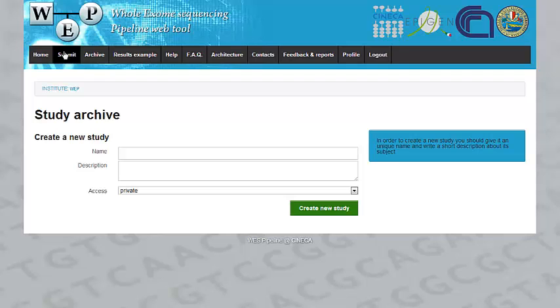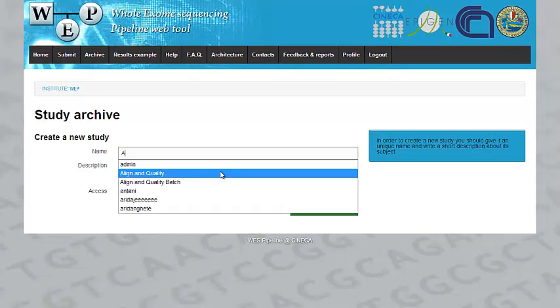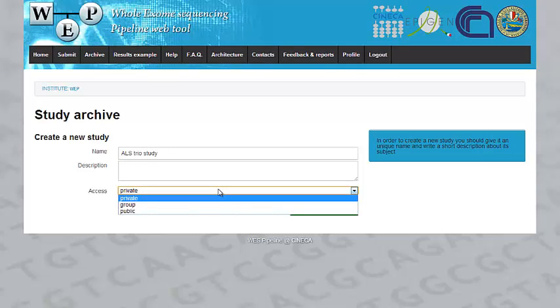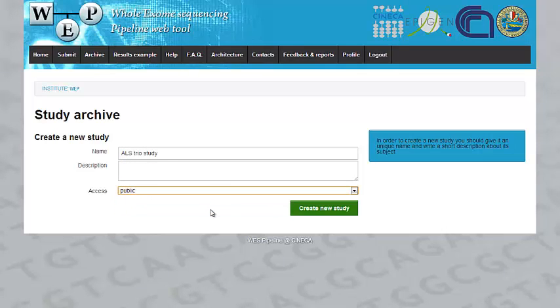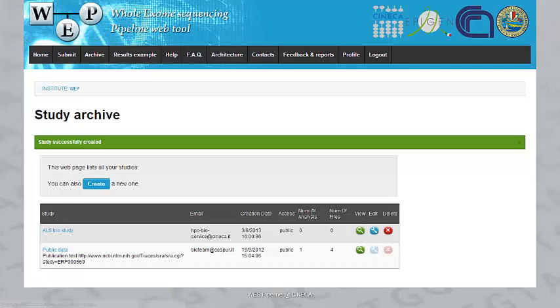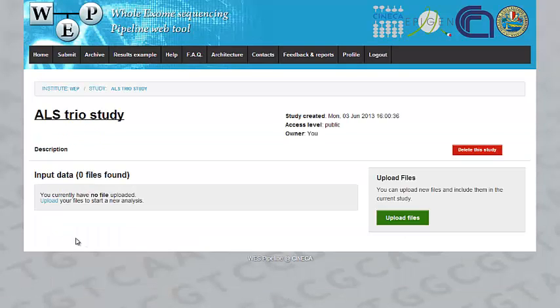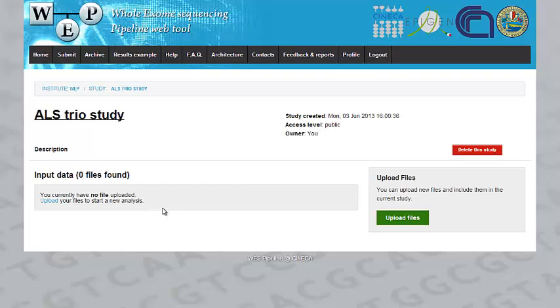A study basically contains all the information regarding your project. When your study is created, you're going to be able to enter the project page. You're going to find some details about the project and all the details about your files and your current analysis.